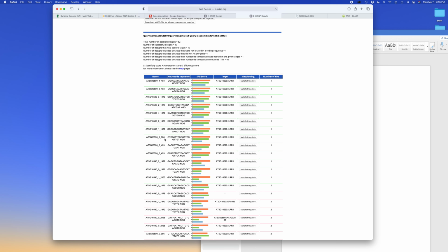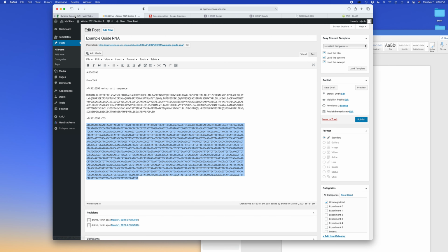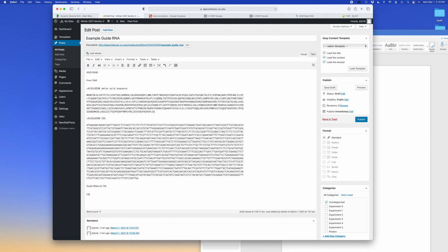So then I would copy and paste this into my E notebook. Actually, this is one potential one. So upstream would be that.